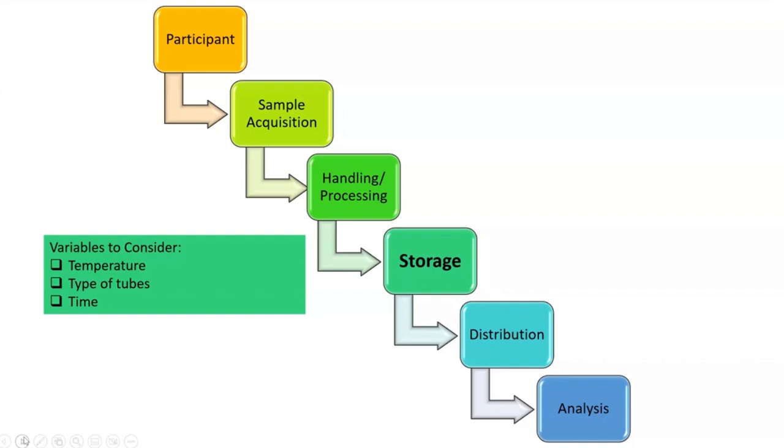And then also be thinking about, because typically what happens is we collect our samples over many months, oftentimes years, and then we're going to send it all to the lab at the same time. So how long will you need to store it? And are you going to continue to store samples even after doing this particular study that you're currently funded for? Are you going to continue to store those samples? How are you going to do that? Where are you going to do that?